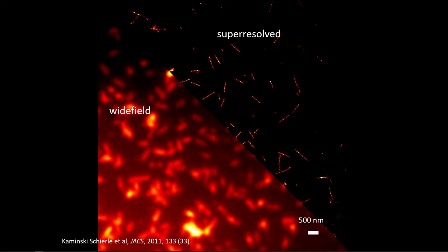The microscopy image on a cover slip of these labeled samples looks like this. Here you see a scale bar, 500 nanometers, and you see these fuzzy images because each fluorophore on these fibrils gives rise to a blob of light. It's a convolution of the PSF with the sample structure.